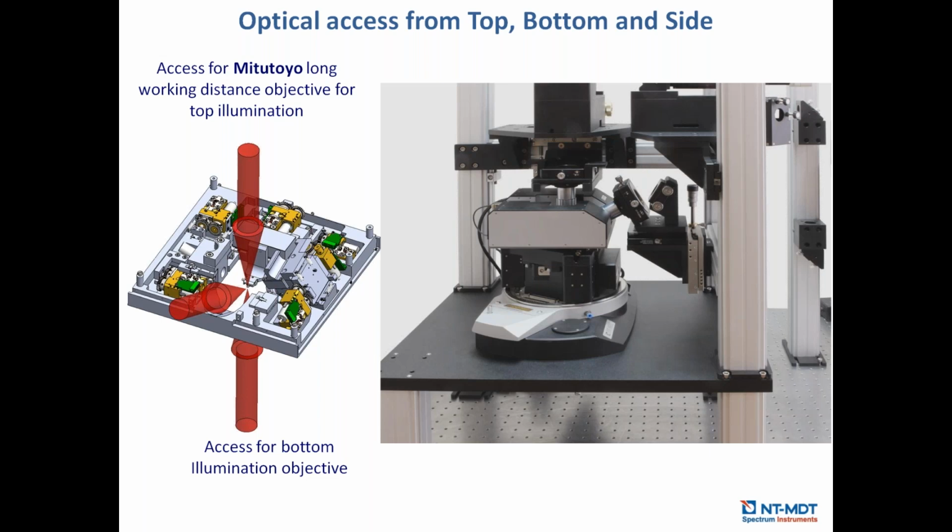Okay, and the next question is related to the AFM feedback loop. You have mentioned different ways of keeping the tip close to the sample, like contact mode, tapping mode, and hybrid mode. What is the best way, and what are the advantages and disadvantages?